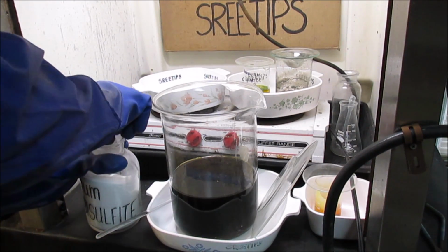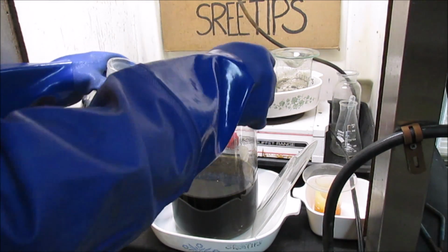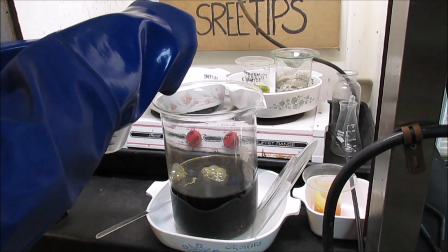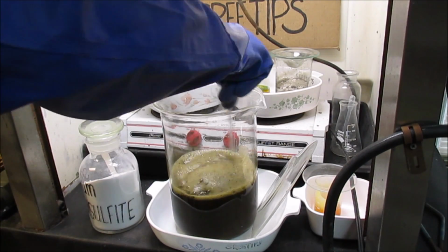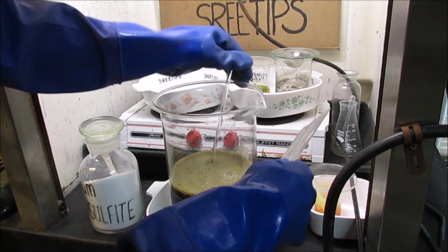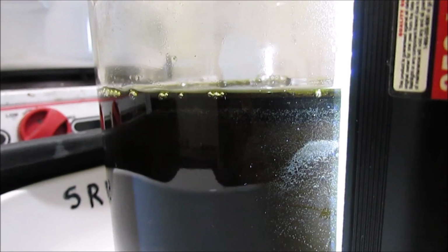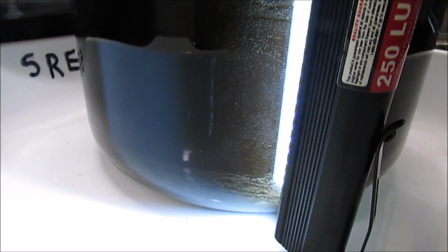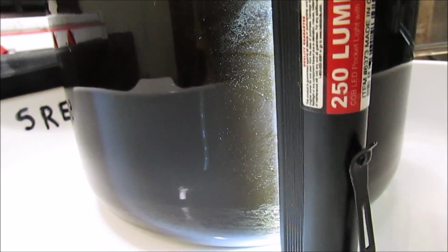After examining the solution, it didn't quite look right, so I decided to add some more SMB here to see if I can get any gold that might still be in solution to drop out. Solids are starting to come out of the solution now. Down at the bottom, I got some stuff building up. And that's what we seen with our sample. So I think now we're going to be good to go here.